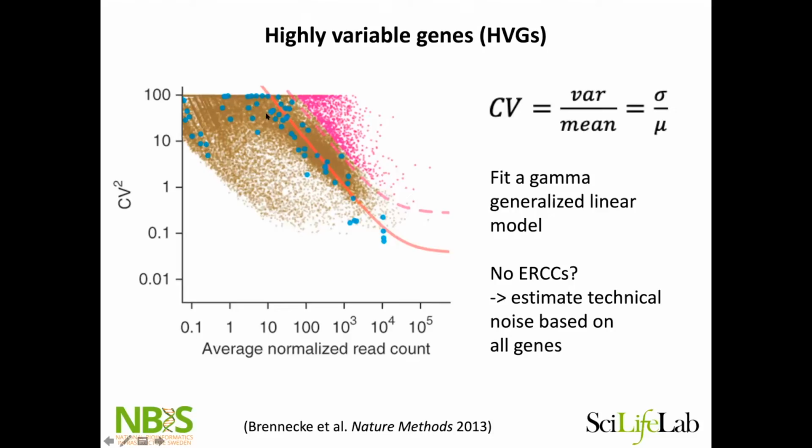the dispersion of the spike-ins, a second line above that one, where they say this is the cutoff for technical variation. Anything that's within this region, we can't say for sure if it's technical or biological. But if it varies more than the spike-in, we can say that these are most likely biological variation.